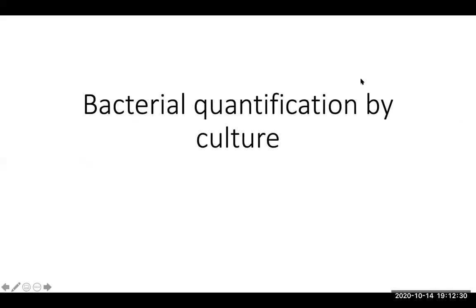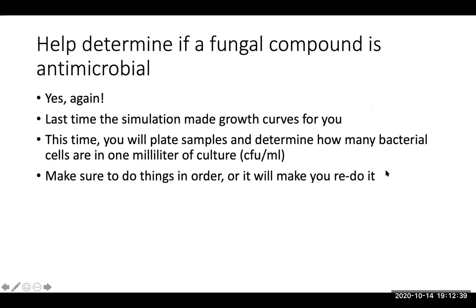And so in the bacterial quantification by cultured lab, you're counting colonies on a plate, and then you account for how many mils you plate on the plate and how many times you diluted it before plating. And then that's how you're able to calculate the actual concentration.